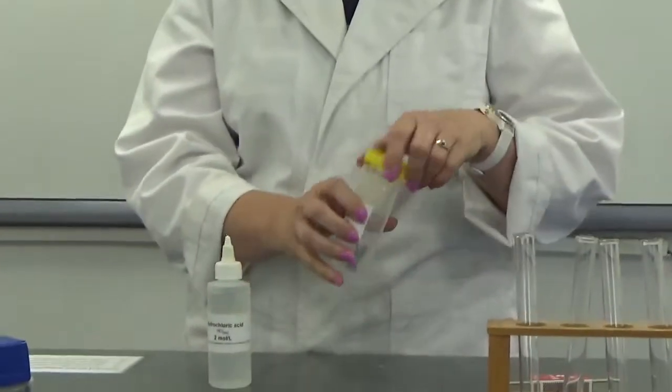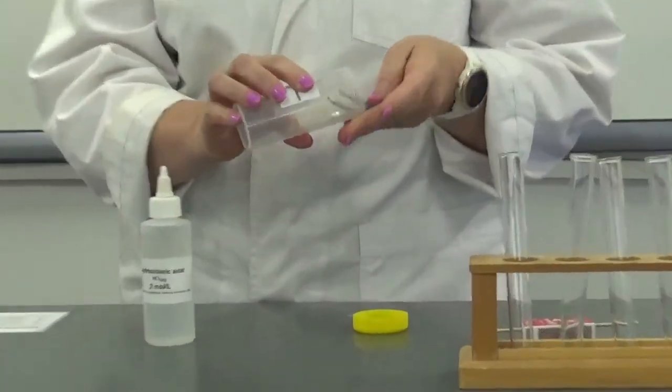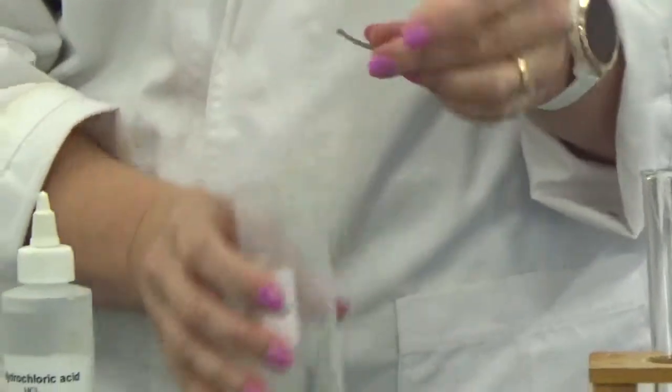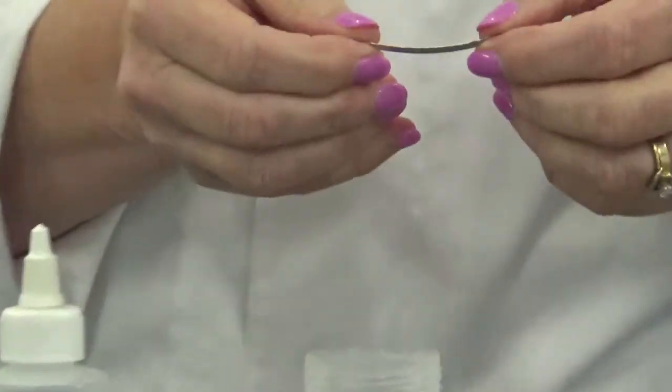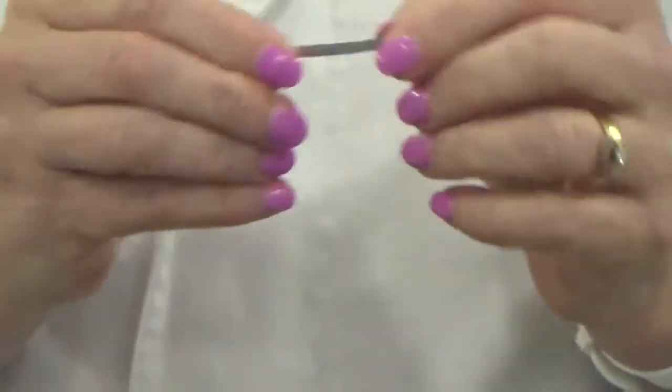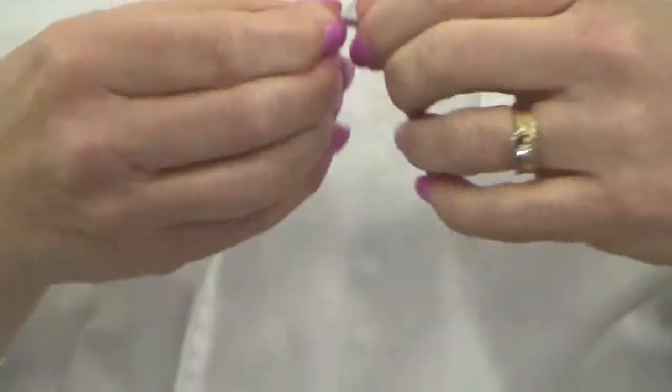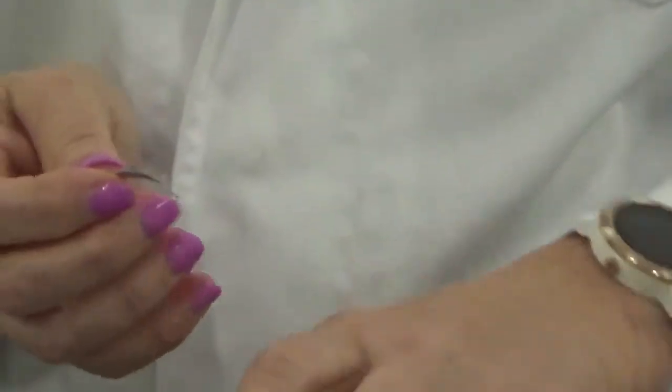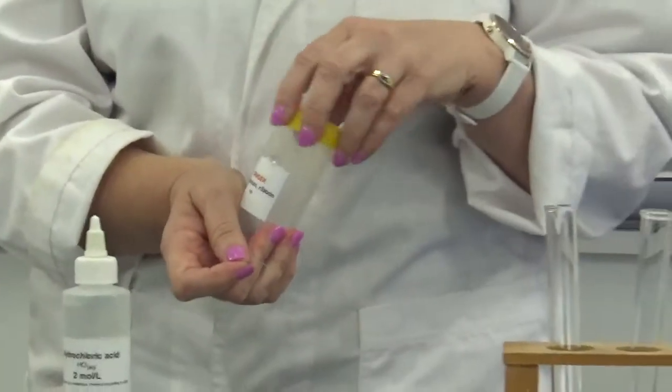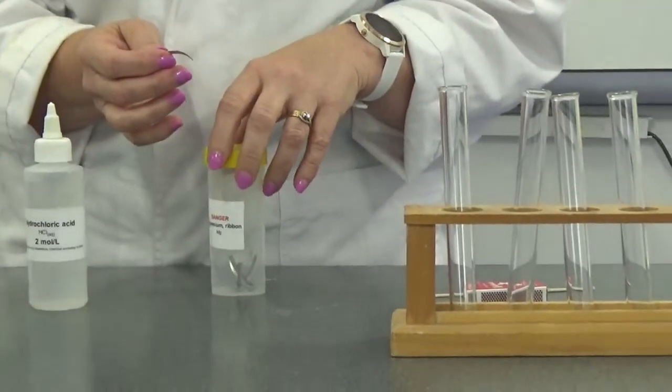So I'm going to take a piece of my magnesium ribbon. You can see the magnesium ribbon's a shiny grey solid that's reasonably flexible. Most metals are fairly flexible. The proper word for it is malleable, which means they don't break when you bend them.